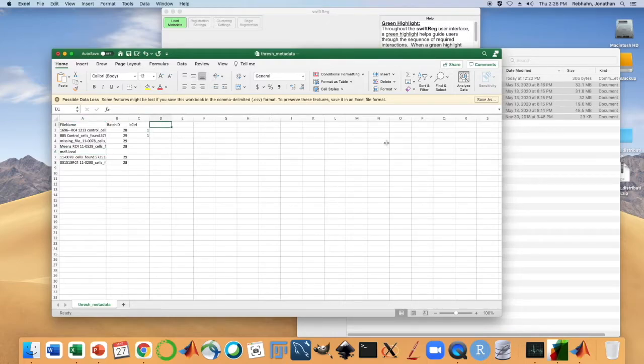And again, we should specify our reference, our samples to register, and our samples to shift. For the reference, we'll use just this first sample.